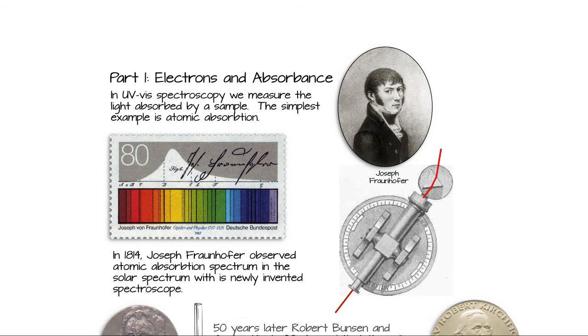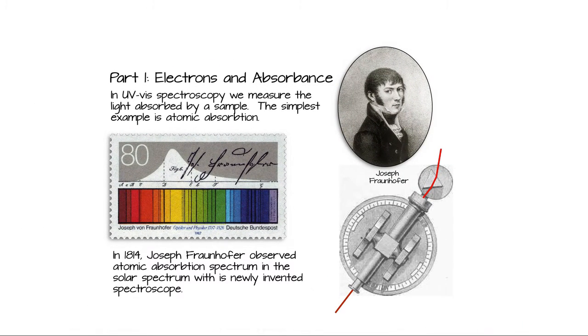The Germans were making fine optical instruments back then, and of course it was only a matter of time before they started to look at light with those optical instruments. Joseph Fraunhofer was the number one optical technician in Germany at the time, and he invented a spectrograph, really. I suppose the first spectrograph. It was a telescope connected to a prism. Then he was able to move it around in precise ways and measure the angles.